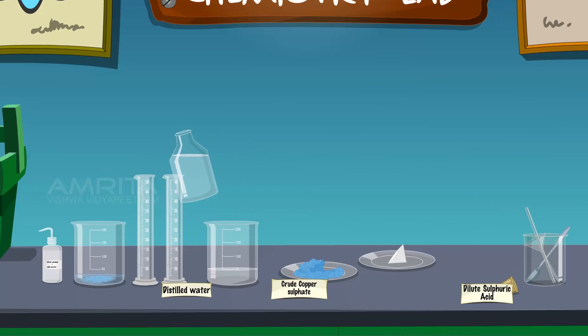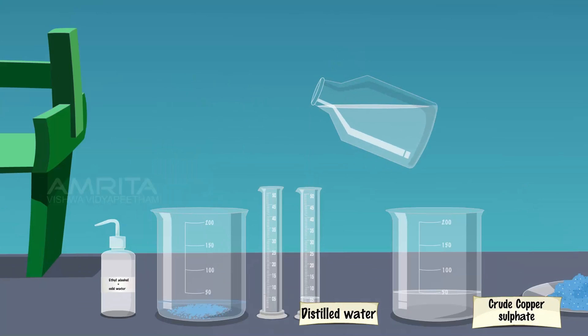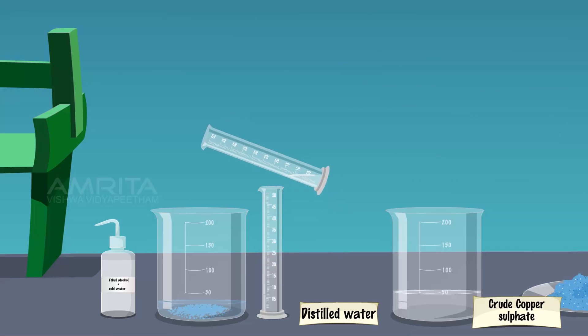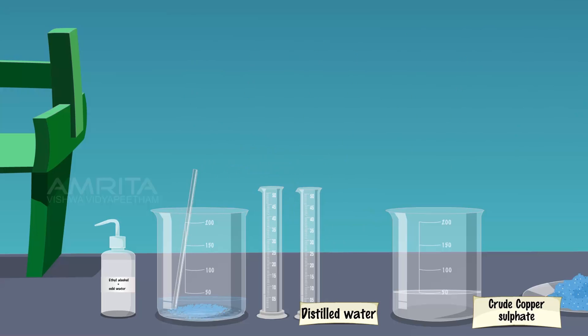Take 5 ml of dilute sulphuric acid in another measuring cylinder and add it into the beaker containing saturated solution of copper sulphate. Stir the solution with the glass rod. Observe that the solution of copper sulphate becomes transparent by the addition of sulphuric acid, thereby preventing the hydrolysis of copper sulphate.